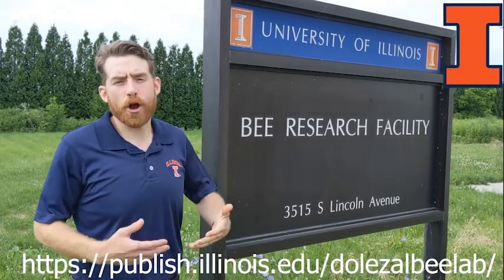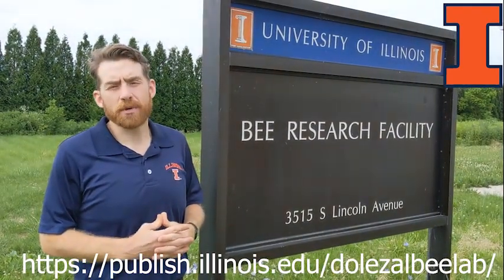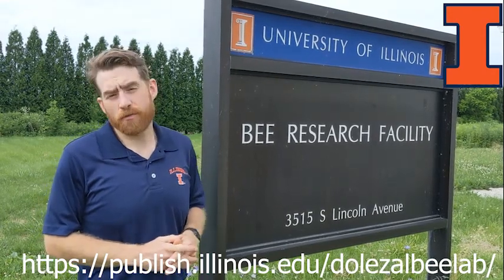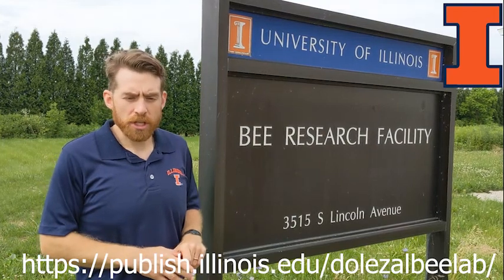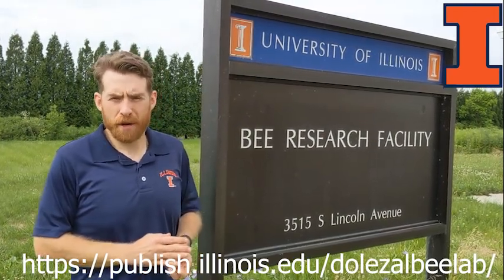So that concludes our tour of the bee facility and the lab space that we use to do the research in my lab. I hope everybody found it interesting and informative. As I said, instead of focusing on the results of what we're doing, I thought this would be a fun opportunity to show how we set up these experiments.